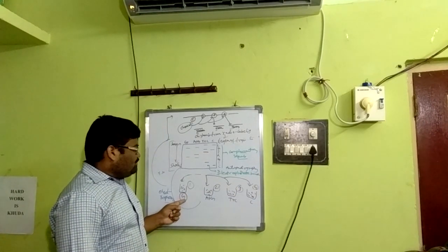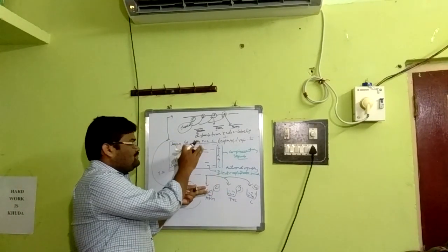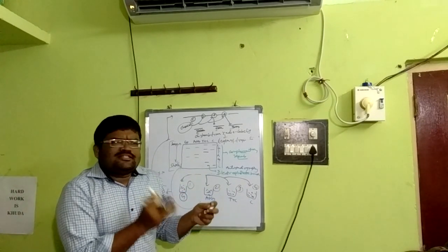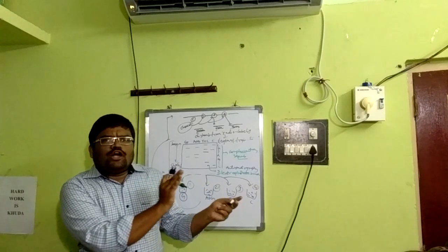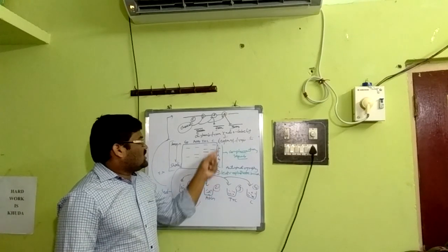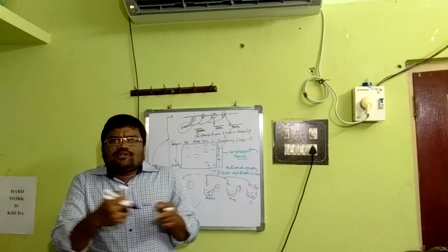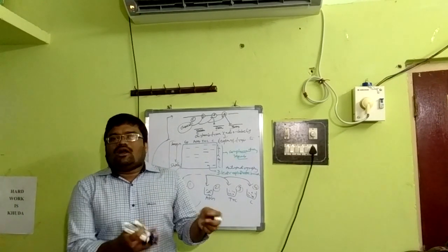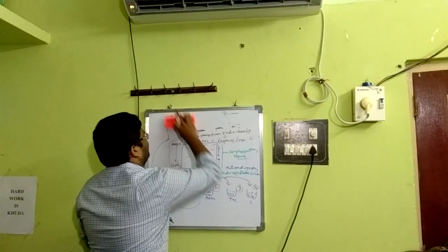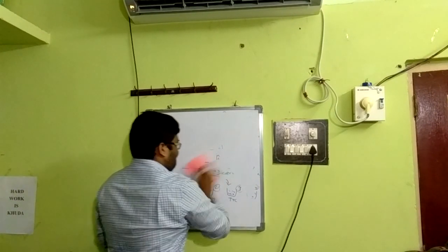Say the test tube G with G residues, A plus G, T plus C. We run the same on the gel side by side. Accordingly, they will develop a specific band pattern. I told you already, the smaller fragments move farther. Then, with the help of autoradiographs, we determine the sequence based on this technique. It is very easy to understand: the smaller fragments move to the end according to the complementary sequence. So it's about Maxam-Gilbert sequencing. And the most important one that we currently follow is dideoxy sequencing.